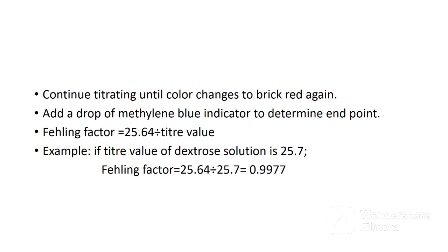Continue titrating until the color changes to brick red again. Add a drop of methylene blue indicator. If the solution remains red, that is the end point of the titration. It is important to know that for accurate results, you have to be keen on your measurements. The time taken to do the titration should not take more than four minutes, and you must do more than two titrations. After your first titration, measure another 5 ml of Fehling solution A and 5 ml of Fehling solution B, put in another conical flask, and do the second titration. After getting the first and second titration results, calculate the average titer value.